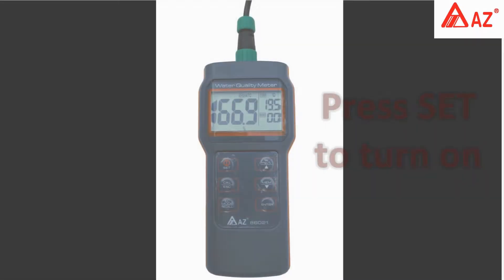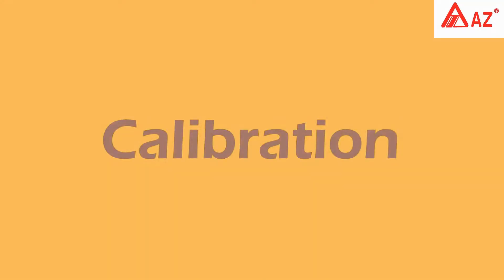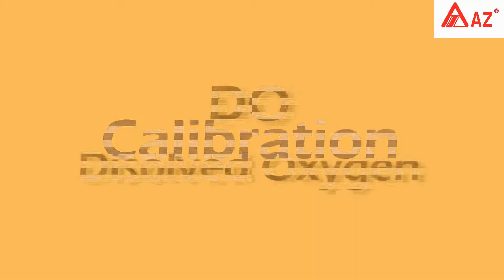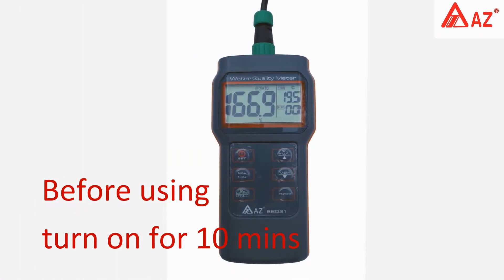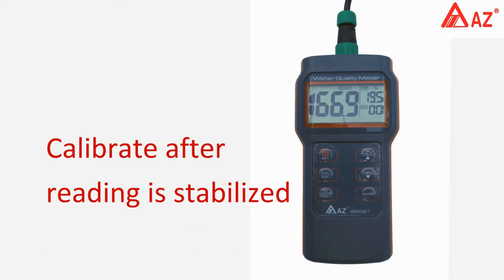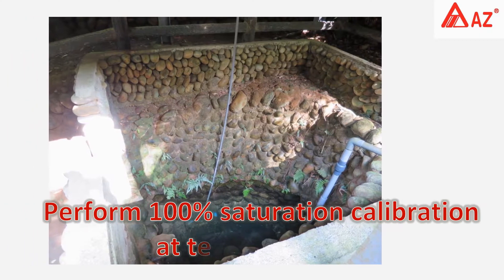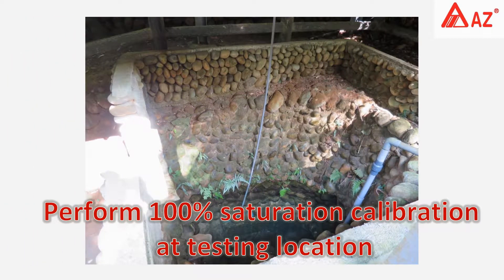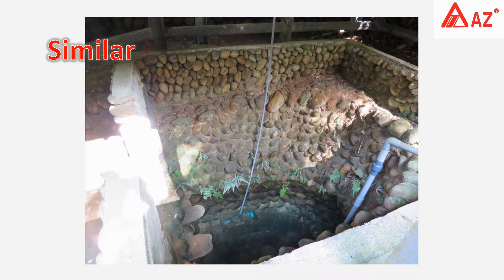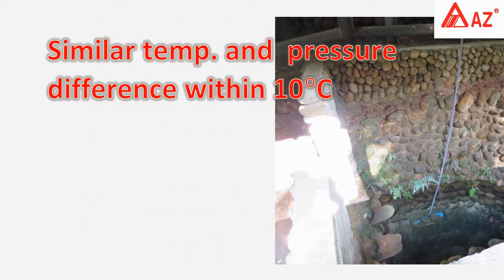Press Set to turn on the meter. The reading will display on the LCD. For dissolved oxygen calibration, turn on the meter and wait five to ten minutes, then calibrate after the reading is stabilized. Before each operation, perform a 100% saturation calibration at the testing location or in a similar temperature and pressure environment. Temperature difference should be within 10 Celsius degrees.